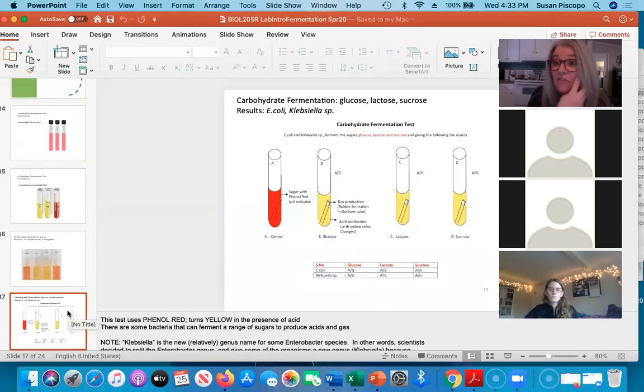All right, I have a series of other carbohydrate fermentation tubes for us to look at. And I've got the other tests as well, the MRVP and the citrate. So what I'm going to suggest is we close out for now, take a little break, and come on back and join into the 5 o'clock meeting, okay? And we'll go through the rest of the tubes.